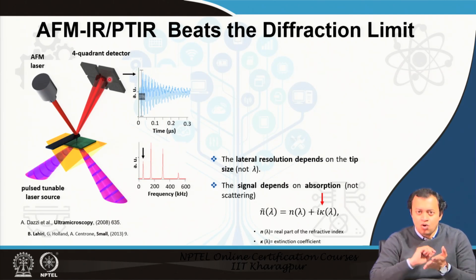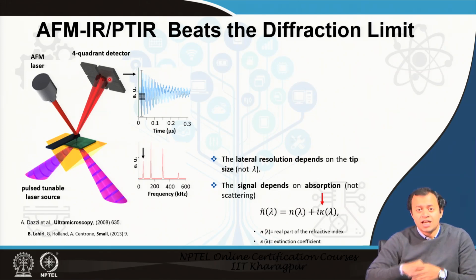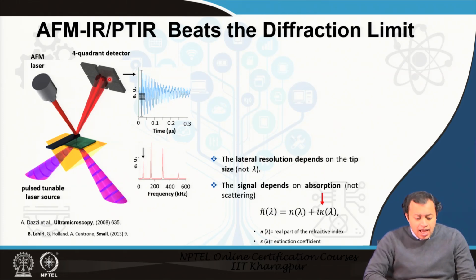So, suddenly the coin that you are trying to get an impression of, some part of the coin's property or shape or morphology has suddenly changed. Why? Because it has absorbed the light, and that light has been absorbed by a specific molecule of that coin. I am giving you an analogy, and you get a back calculated image and you therefore identify what it was or what it was not.